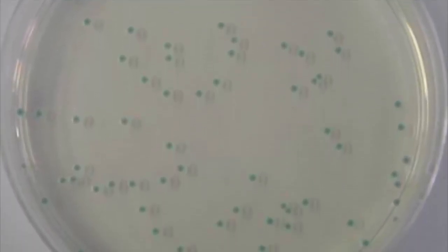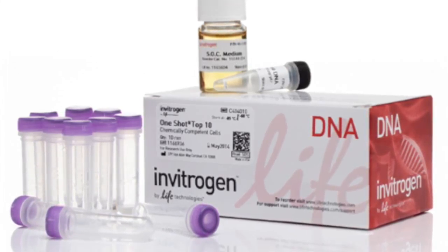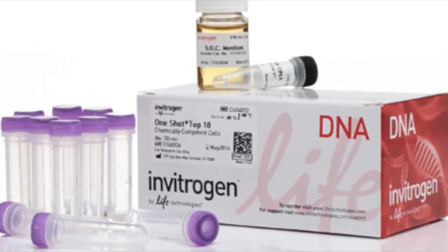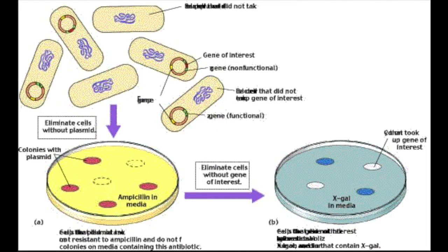As for the efficiency, cells can be transformed with linear fragments, but the efficiency is lower. Therefore, it is highly recommended to use supercoiled plasmid because it has a higher efficiency and is also quicker. On the market, TOP10-type cells contain different features in their genotype. For example, araB14 blocks arabinose catabolism, endA eliminates non-specific endonuclease activity, and lacZ deletes the beta-galactosidase gene, which yields colorless colonies in presence of X-gal, among many other things. TOP10 cells utilize different TOPO vectors depending on your needs.